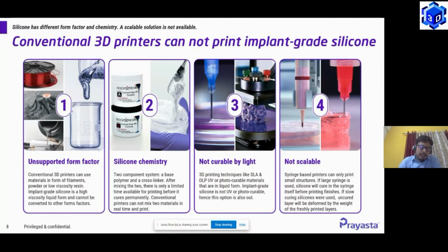So if you look at today's print materials that are 3D printable, you will see either of these three form factors. Either you will see some filaments, going into thermoplastic filaments, going into FDM printers, and then finally getting printed. You may see some powders, both metals and even many thermoplastics are also powdered, where using some laser technique or some binding method, you can make an object.